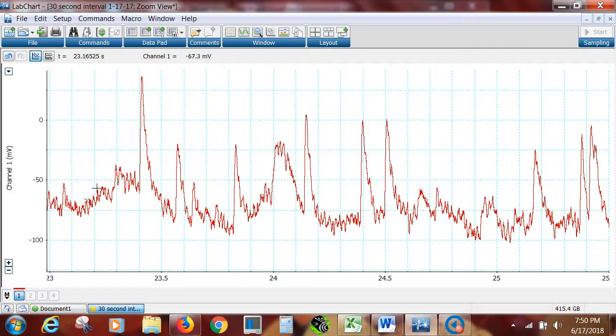1, maybe 2 as the whole, 2, 3. So you see I only got 3 to 23.5. So I can make 23.5, 23.5, and I only got 3.